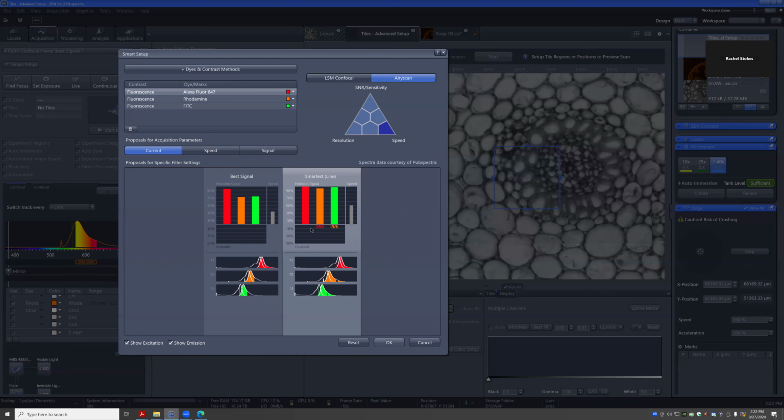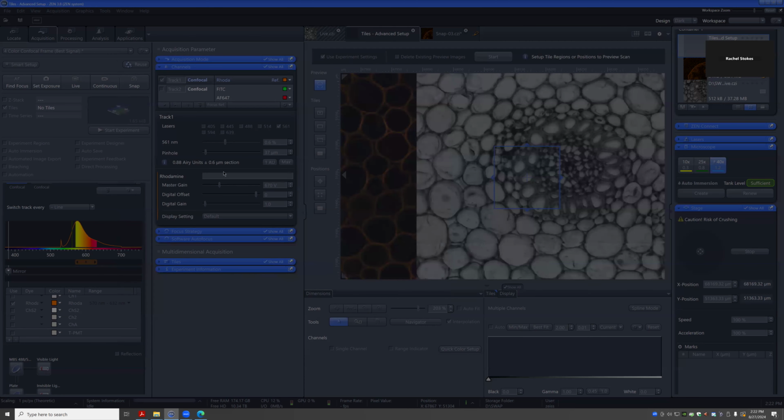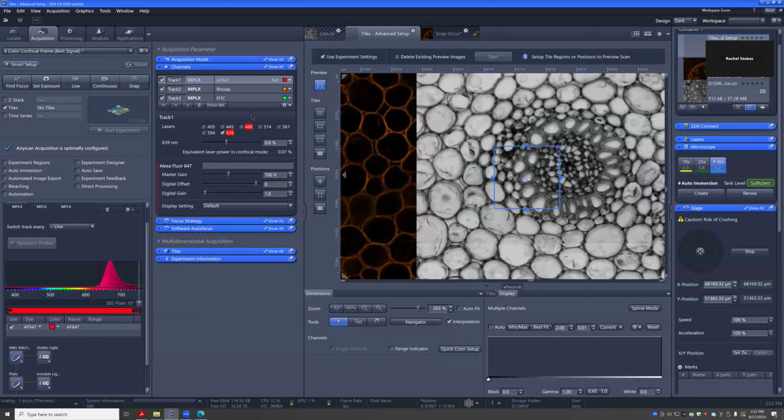mode, we'll just pick it right now so you can see what that looks like. If we pick that mode on the area scan, we will see here in that acquisition mode screen, you actually see the other modes sitting here as well. This is why on that triangle, I'm saying you can always start with that bottom corner and then pick one of the other modes here. So 8Y, 4Y, they all live here.